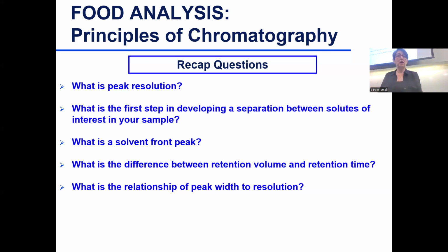And I'm wondering in LC, if the solvent and the mobile phase are the same, would that ever happen? Like if you're doing hexane, a sample dissolved in hexane, and hexane is your mobile phase. So will we not see a solvent peak? Is that what you're saying? Well, I don't know. I'm assuming you should because detection starts when you hit the injection.